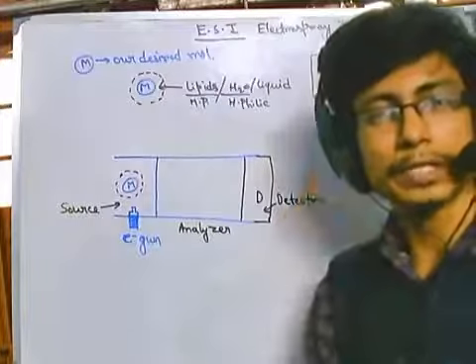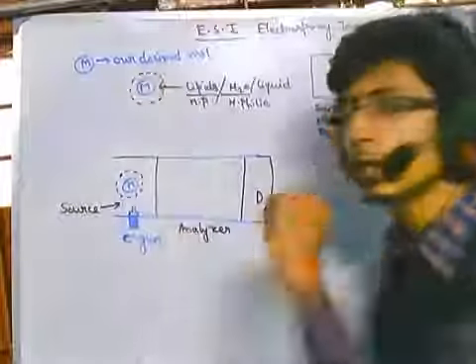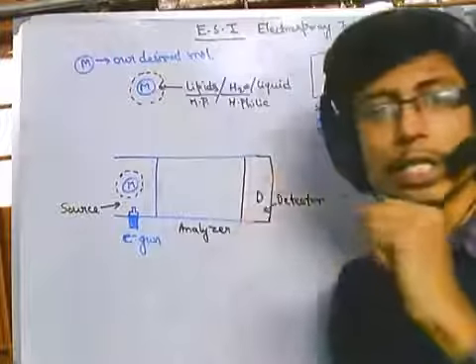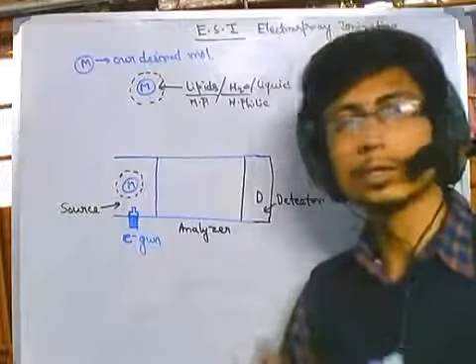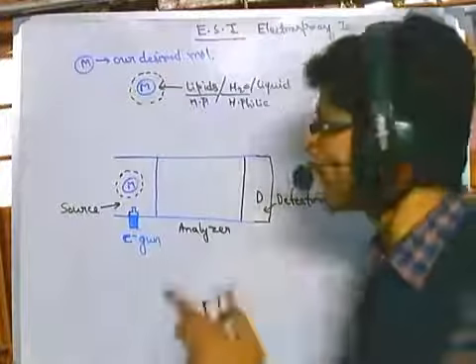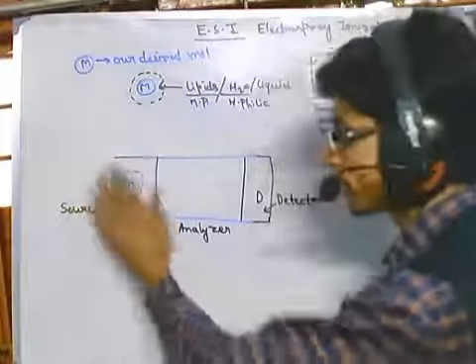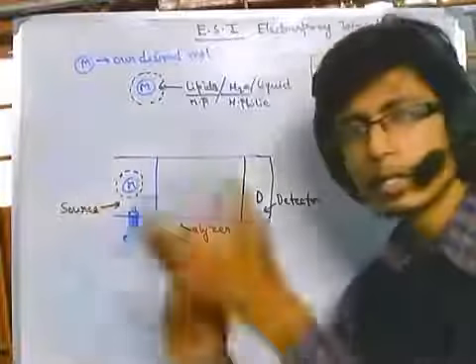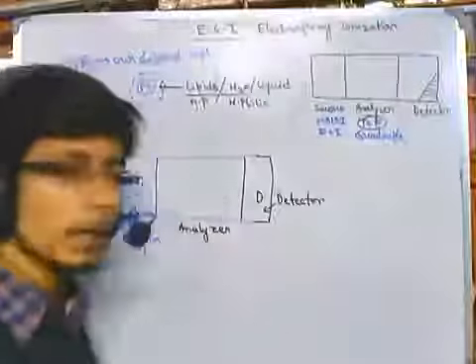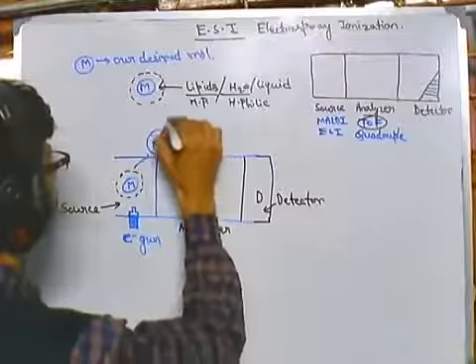Instead they use the chemical ionization process, which is soft ionization, because the actual idea and goal behind coating this molecule with this droplet structure is to prevent the molecule of our interest from being bombarded with other molecules, so that it is not getting hampered. We don't want our molecules to be hampered, so for that reason we are coating it. Now after electron hitting or any kind of chemical ionization, it is getting ionized, and what it produces is simply parent ions or fragment ions. It can produce small different fragments or particles.